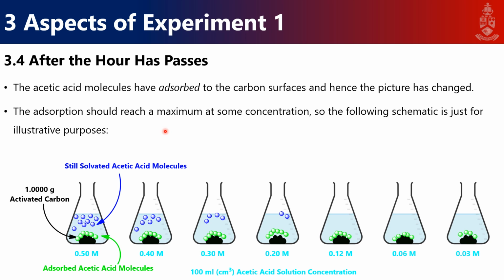Now, like I said, the hour's passed, and your acetic acid molecules have adsorbed onto the carbon surfaces. And so in other words, our picture has changed a bit. Now we have, in certain cases, no acetic acid left in solution, and all have been adsorbed. So all the blue dots have become green dots. And at some concentration, this is not exact, this is not where it necessarily is going to happen. Please do not take this as your experimental section.